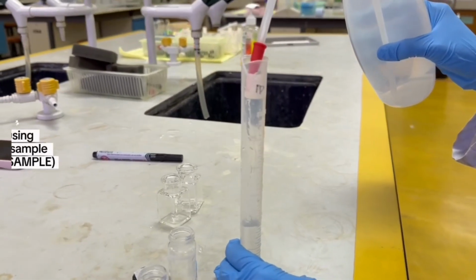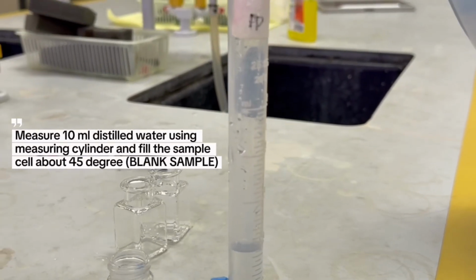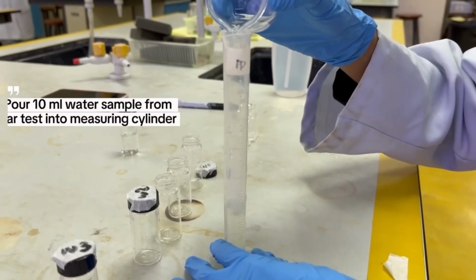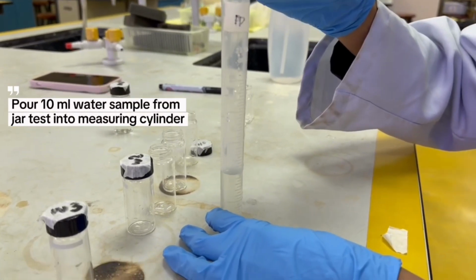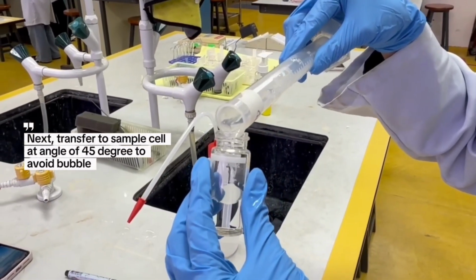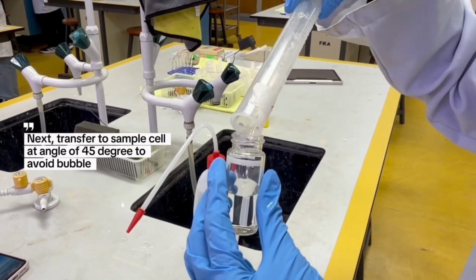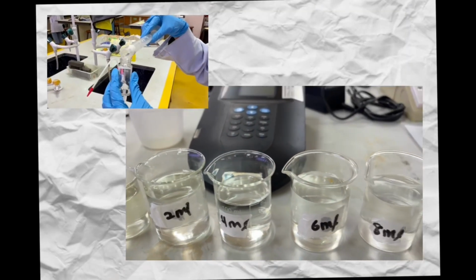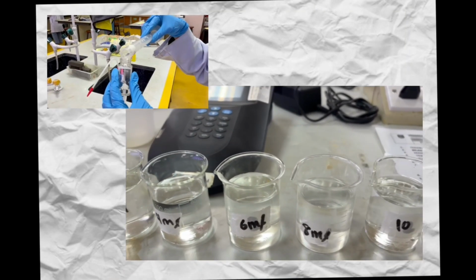First of all, prepare a blank sample by measuring 10 ml of distilled water using a measuring cylinder and fill the sample cell at 45 degrees to avoid bubbles. Next, measure 10 ml from each of the 6 beakers of water sample, then fill the sample cell at 45 degrees to avoid bubbles and level it. The measuring cylinder must be rinsed with distilled water every time when measuring a different water sample. Repeat steps 2 to 3 using the second beaker of water sample until the 6th beaker.